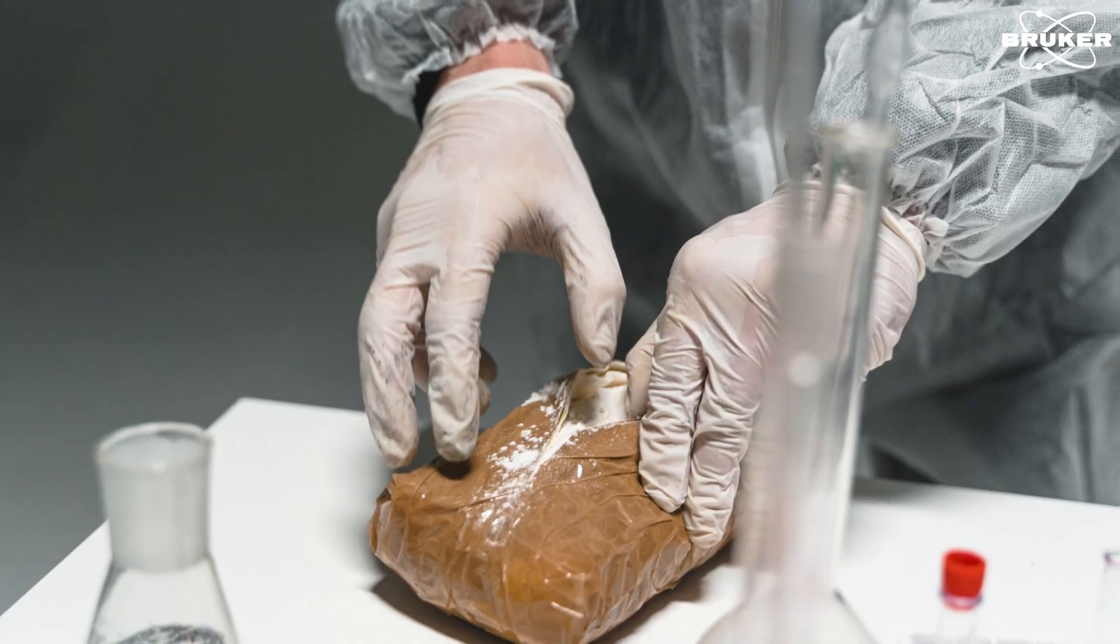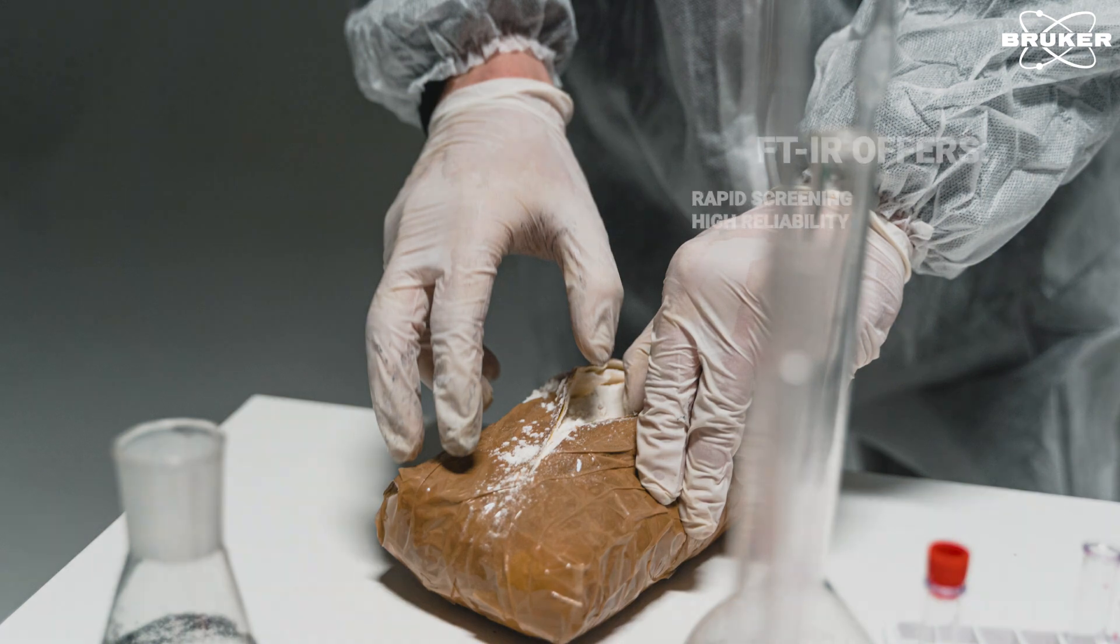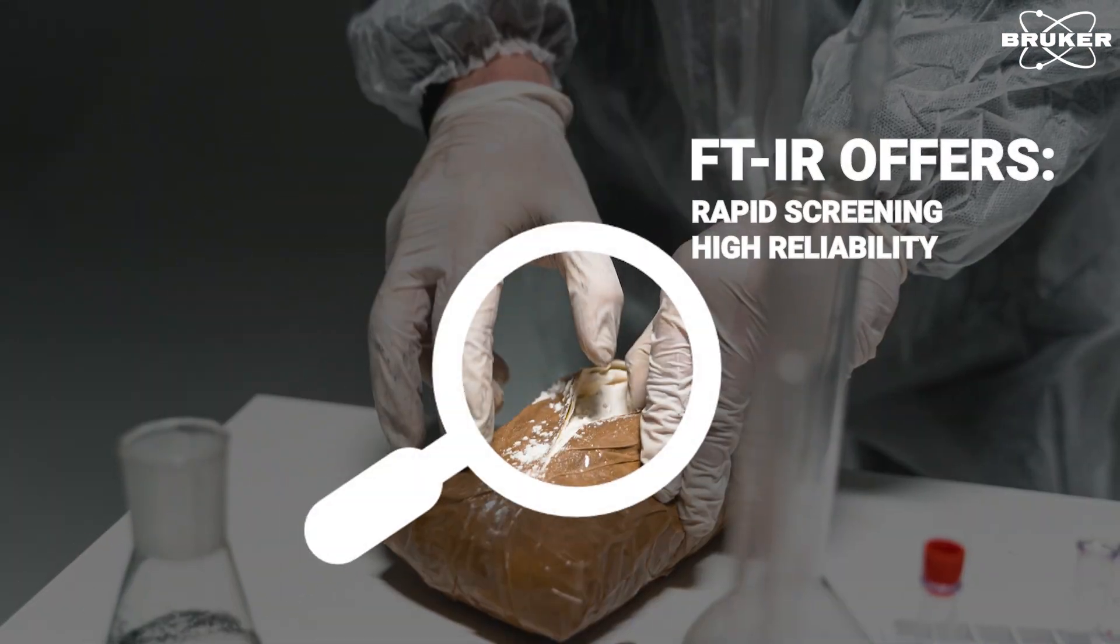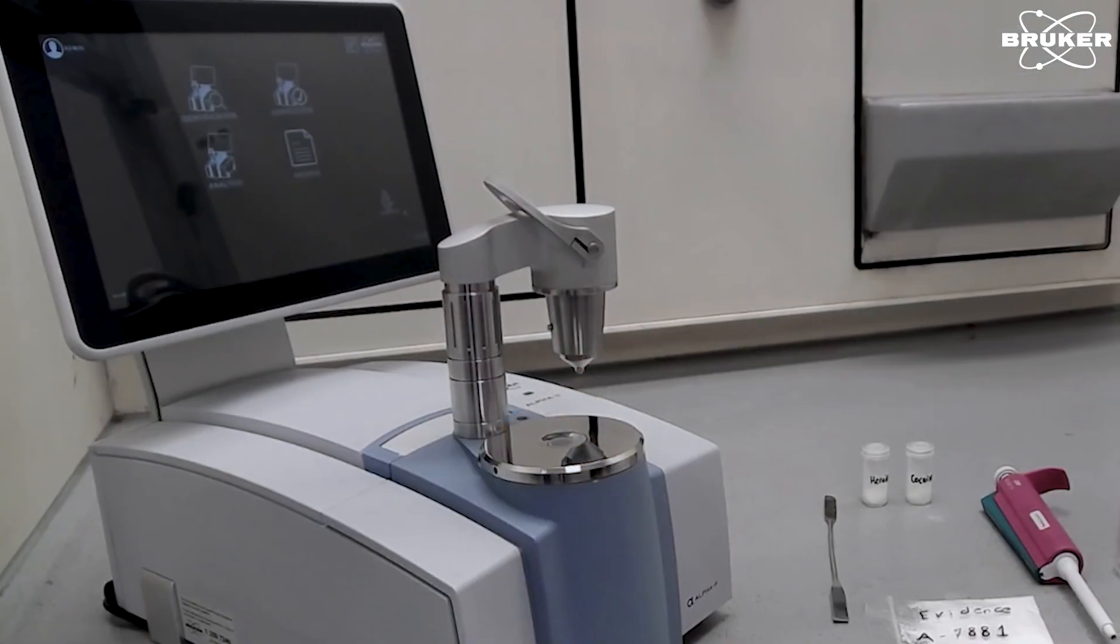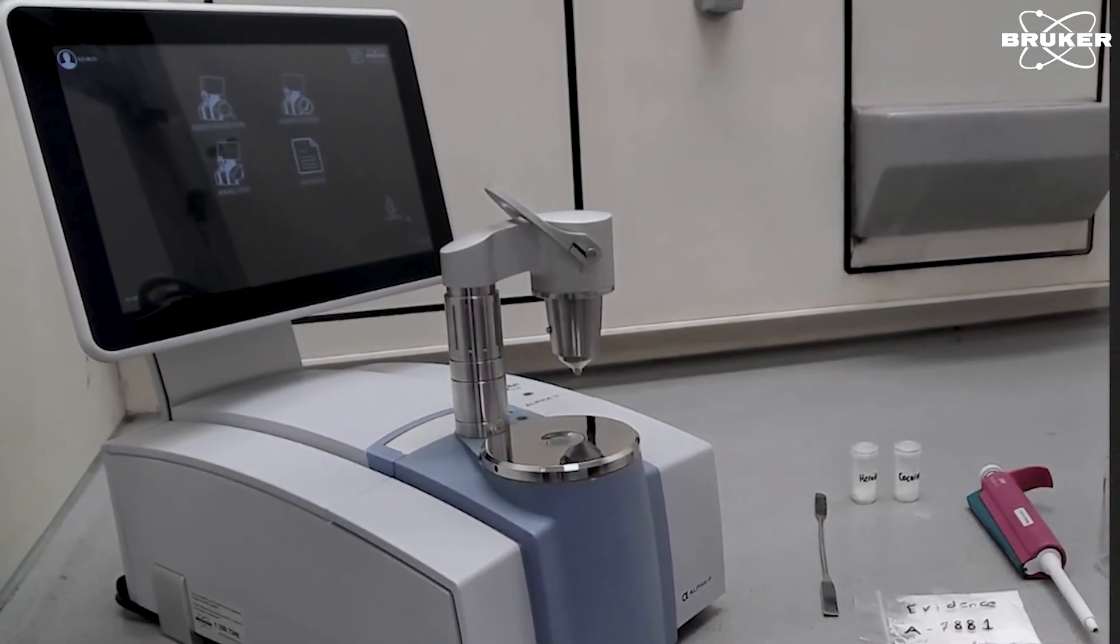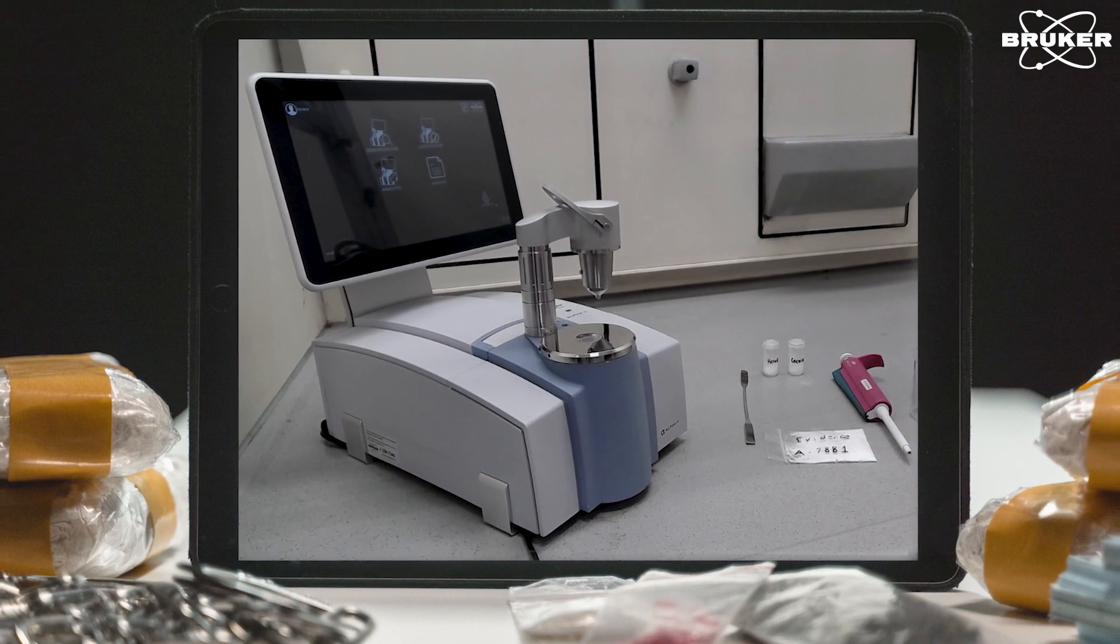In this context, the forensic analysis of illegal substances by FTIR demonstrates rapid screening potential and a high degree of reliability for the identification of evidence using the alpha tube. This, for example, helps law enforcement and forensic scientists to make accurate statements in court.